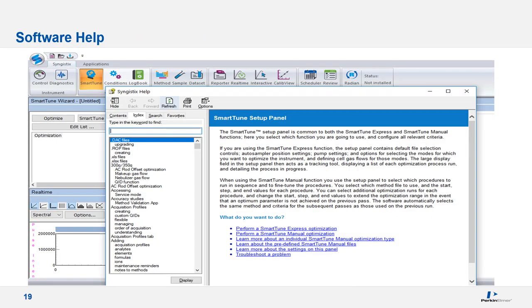Another software feature that may be helpful is the help function. In my slide, you can see the smart tune window is live. I can now click F1 and the help screen that applies to this particular window is shown. This makes it much easier than trying to produce the correct terminology to find what you're looking for through the index feature. This option works on any screen within Syngistix.